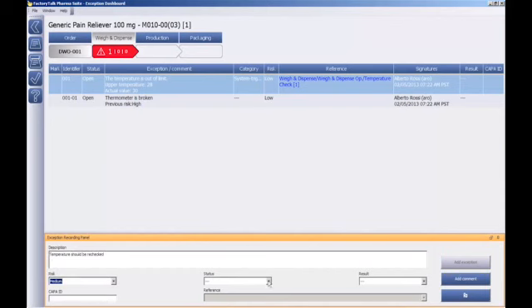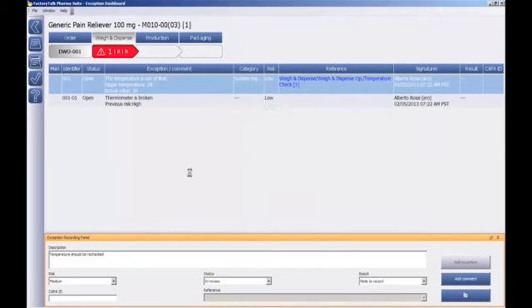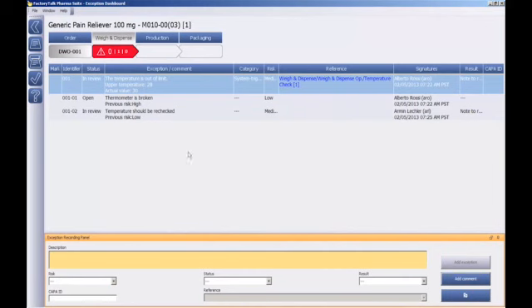Set the risk to medium. Status is in review. Note to record and sign off. The number 1 has now shifted position due to the status of the exception. It was previously open, and now it is in review.